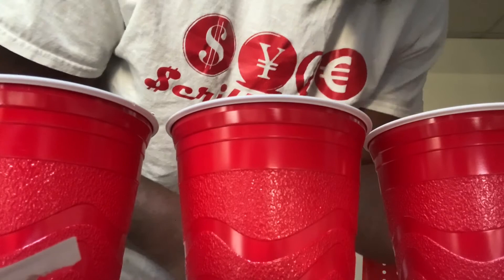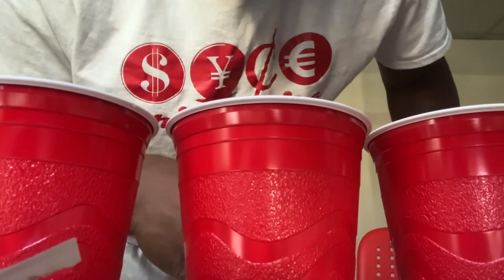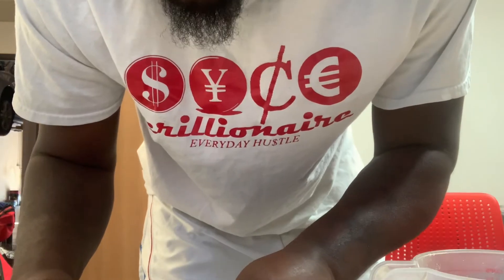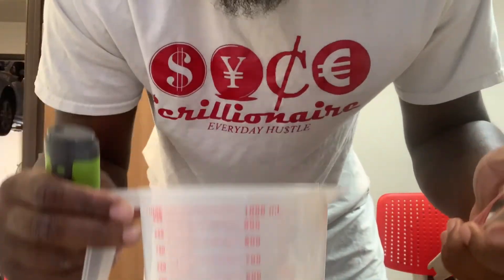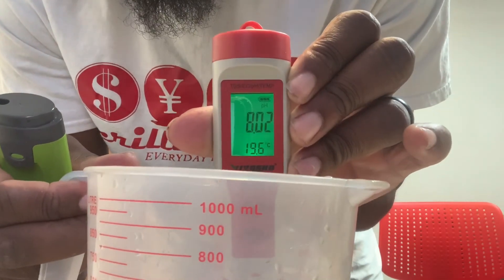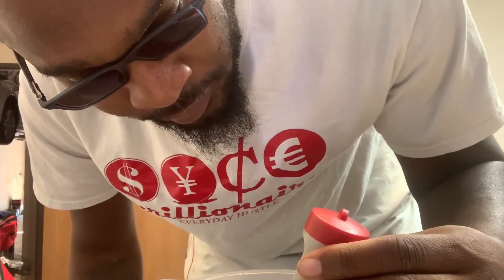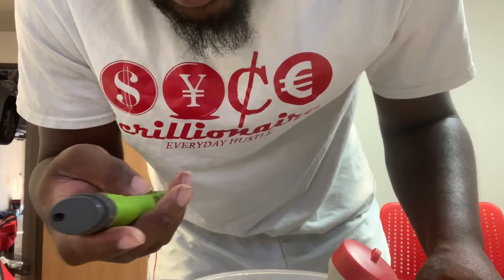I'm going to grab my other pH pen and we're going to test the calibration — see how close it is to my Oktan pH pen. We're going to get some RO water and test it. So I went and got my Oktan pH meter and we have the VivoSun pH meter. We have some distilled water here, so we're going to go ahead and test it — turn this on, stick it in the water, see what it reads. Wait till it stops — looks like it's reading around 5.9.